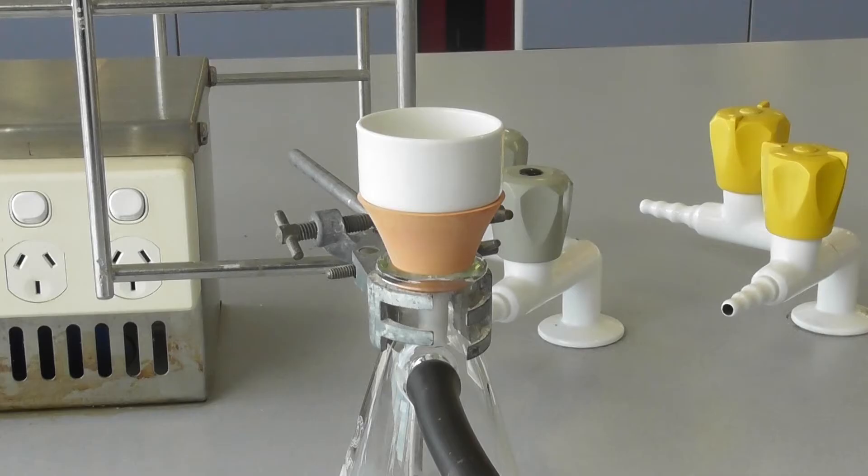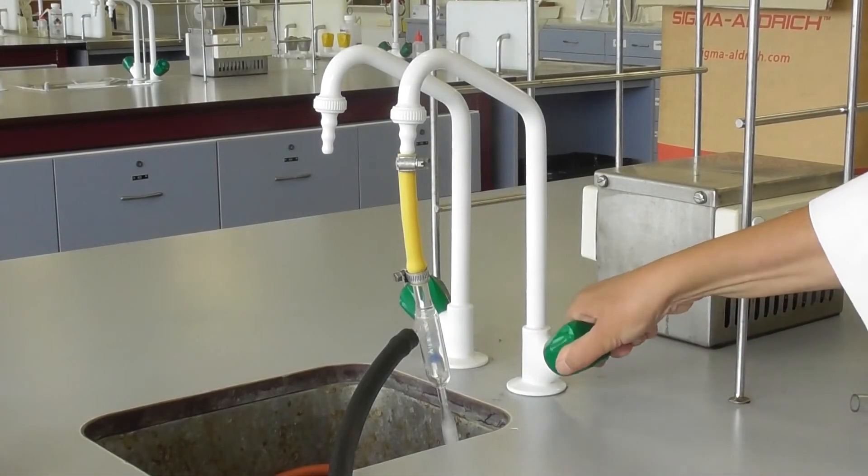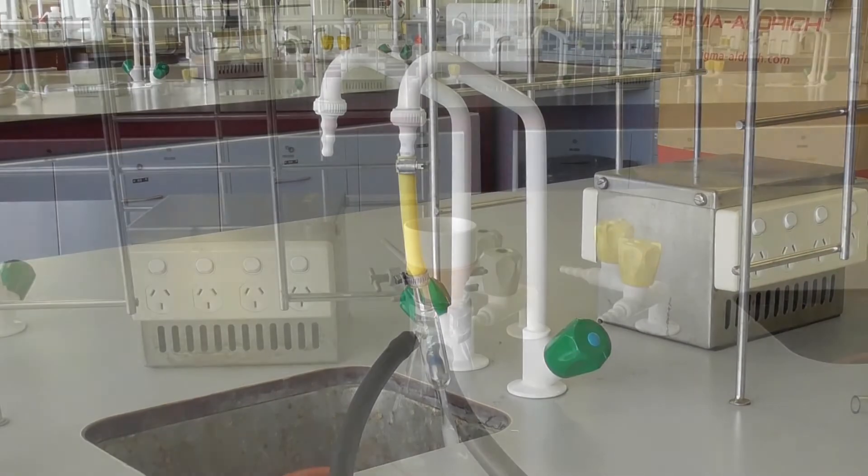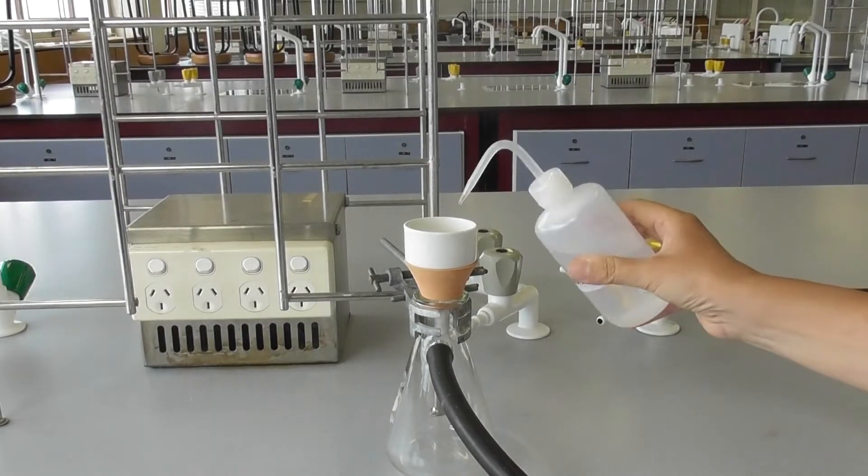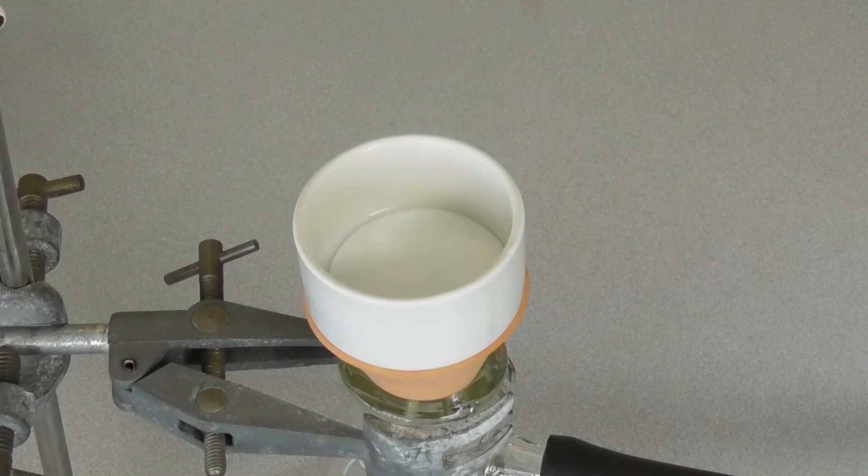Add the correct size filter paper. Turn on the vacuum. Wet the filter paper with the fluid you are filtering to ensure the filter paper sits in the correct position. Here we are using distilled water.